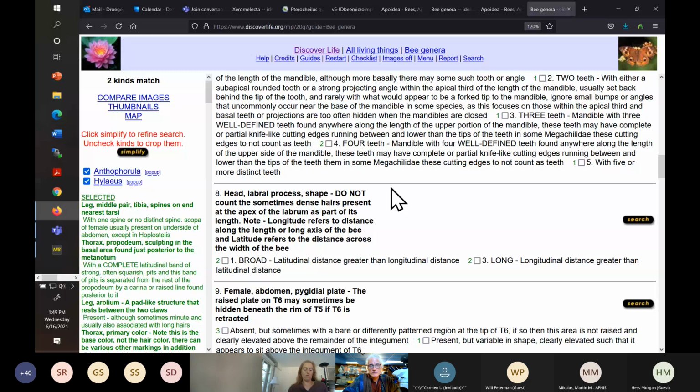Mandibles and labrums sometimes are visible even though they're folded together in terms of the particular feature you want. But I can tell you that it is kind of a gift to have specimens with their mandibles spread, because a lot of times it's just so much easier to see things like a small tooth hidden towards the back of the specimen, rather than trying to peer through hairs, folded over areas, or underneath the head of the specimen. Your call. It's time consuming though. But museums love that. That's a much better specimen to gift to a museum than the kinds of things that we just roll through.